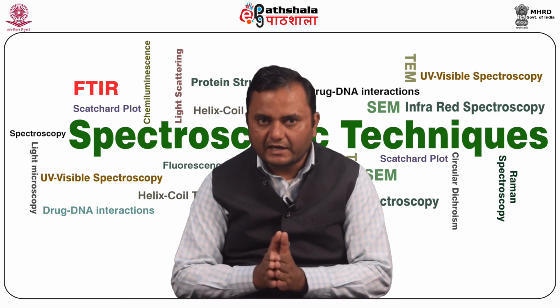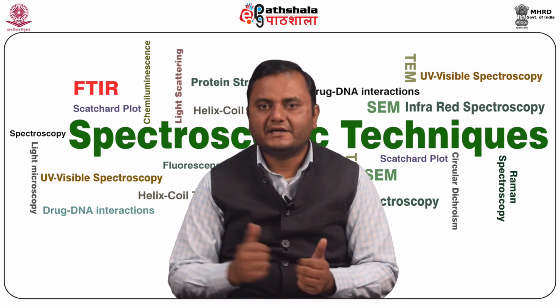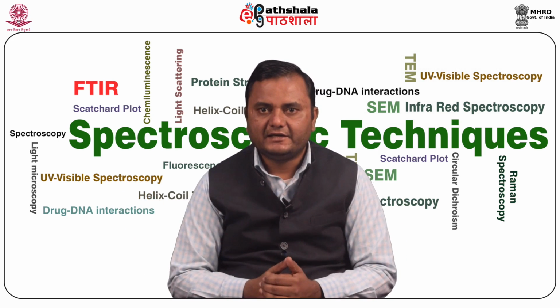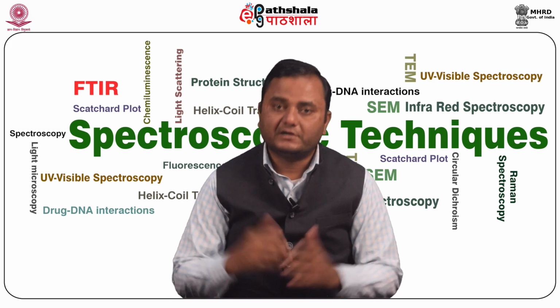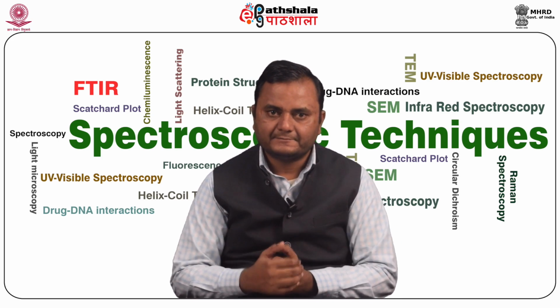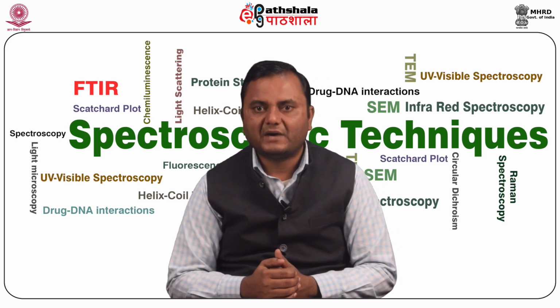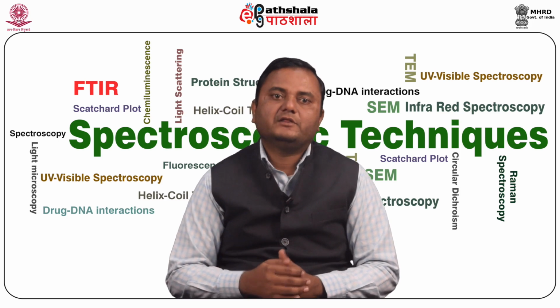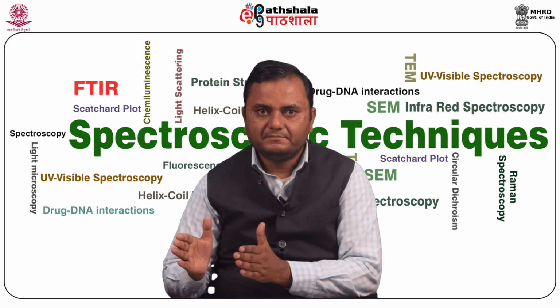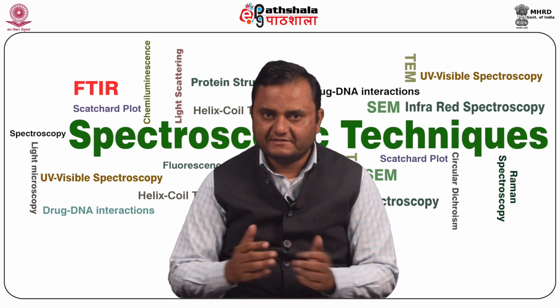dividing the incoming IR beam into two parts. The two plane mirrors reflect the two beams back to the beam splitter, where they interfere either constructively or destructively depending on the position of the moving mirror. The position of the moving mirror is expressed as optical path difference, and the optical path difference is the distance traveled by the red beam minus the distance traveled by the yellow beam, as given here.